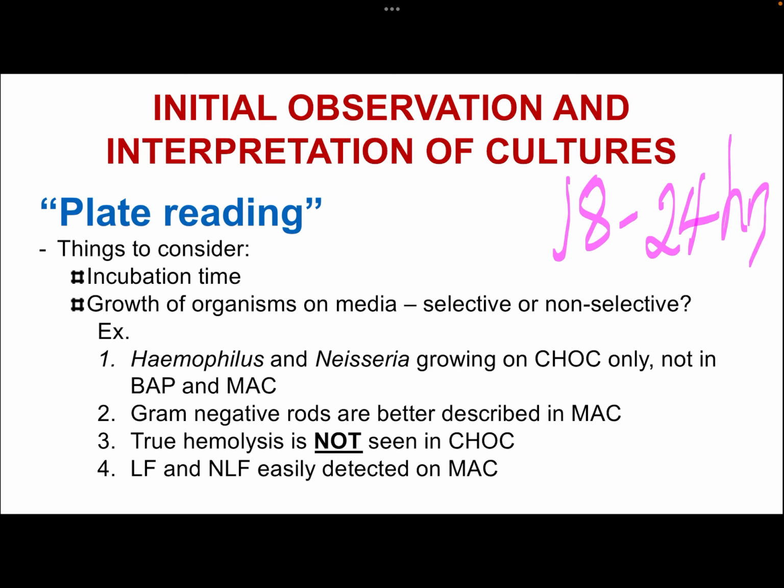Just like, for example, in the sample problem, we have a result for gram stain, which is presumed to be Staphylococcus aureus, right? Because again, we have seen cocci in clusters, gram positive. So you have to take note that incubation time is important for S. aureus, because the colonies of S. aureus appear smaller when the culture is still young.